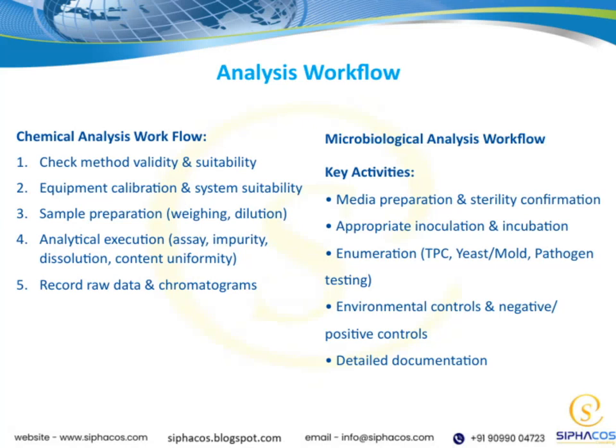Let's take a closer look at the microbiological analysis workflow. First, key activities include preparing the media and confirming sterility to ensure no contamination. Then, we move on to inoculating samples appropriately and incubating them under the right conditions to promote microbial growth. We also perform enumeration, which involves testing for total plate count, yeast and mold, and specific pathogens, depending on the requirements.